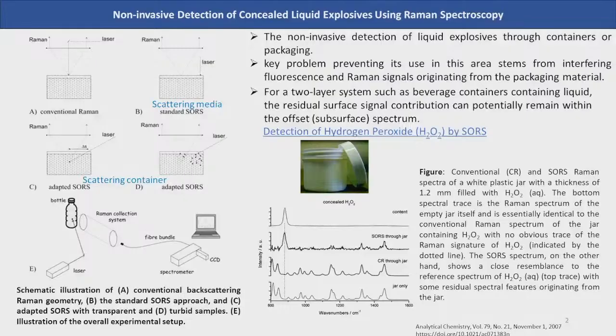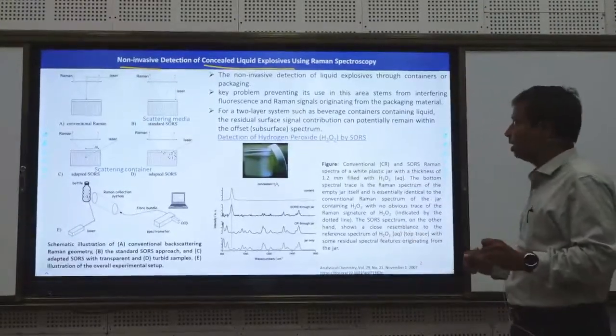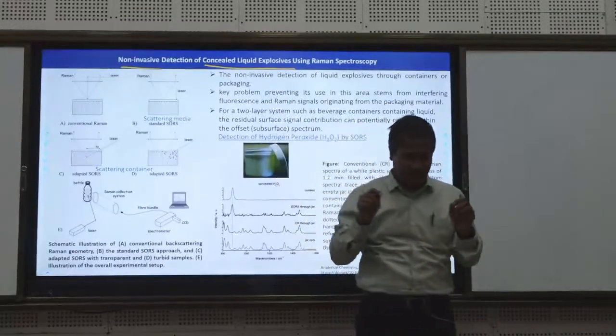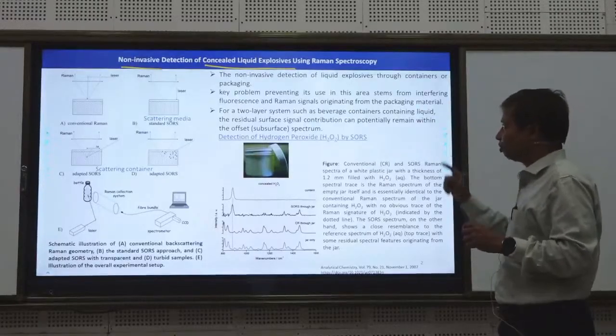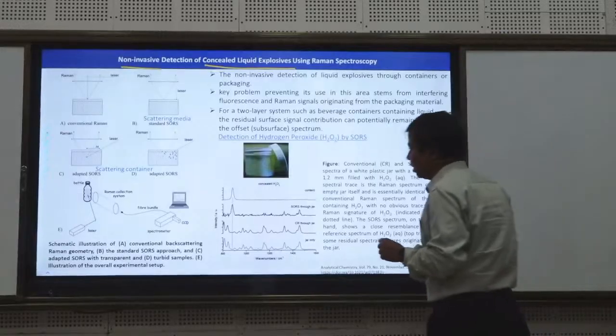Non-invasive means you don't have to do any kind of breaking. You don't need to prepare the sample, and even if it is concealed, even if it is hidden, you can still find out.